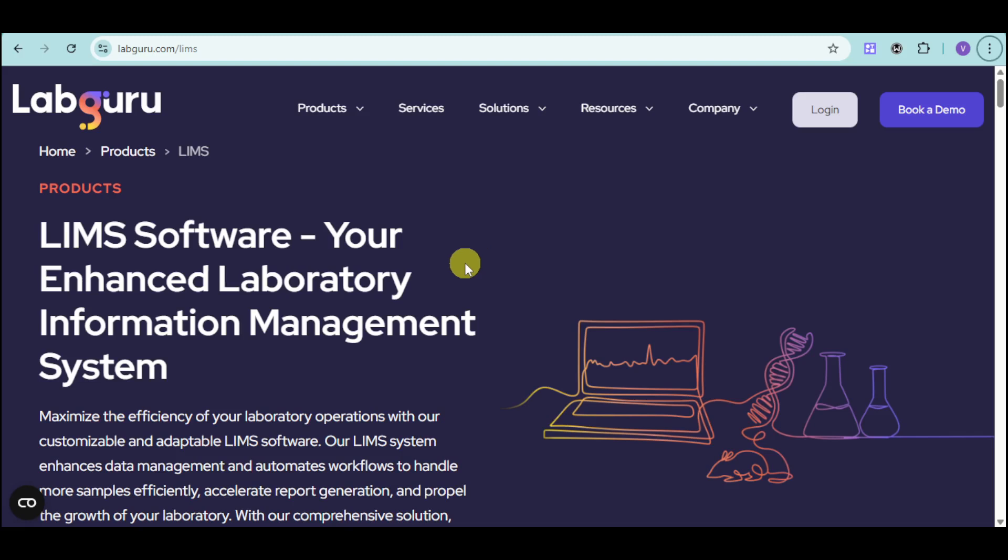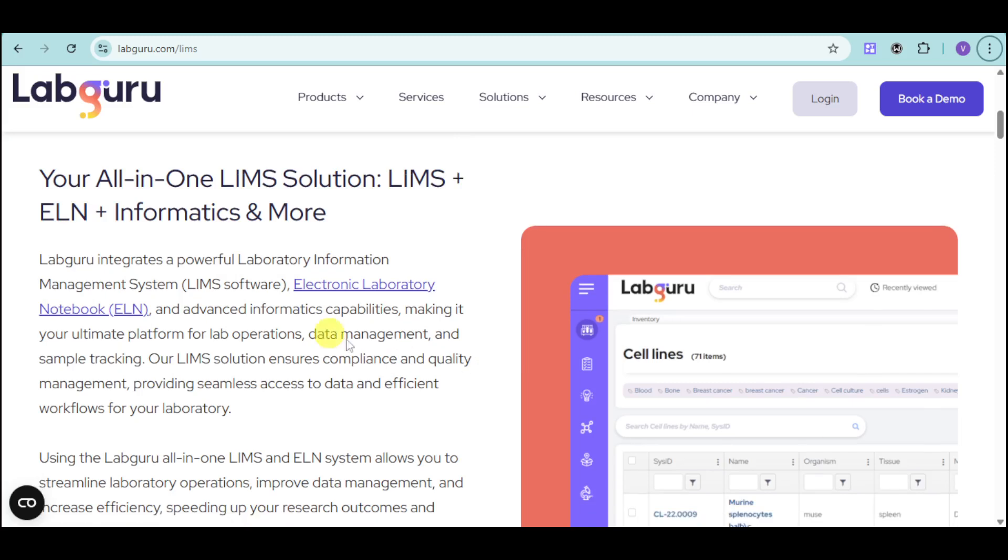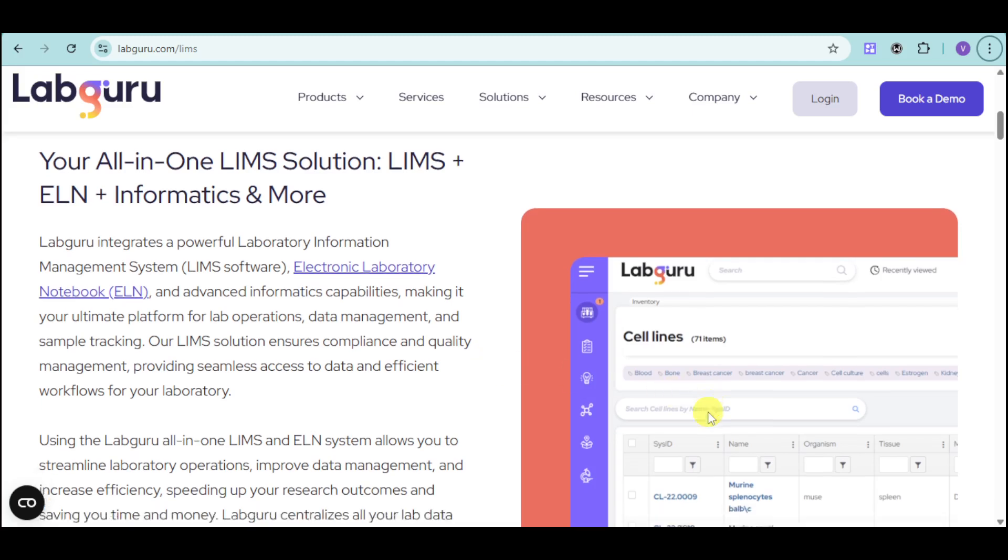LabGuru also has another product, which is the LIMS software, an enhanced laboratory information management system that can help you maximize the efficiency of your operations. This is your all-in-one LIMS solution. You can integrate powerful laboratory information system and advanced informatics capabilities.